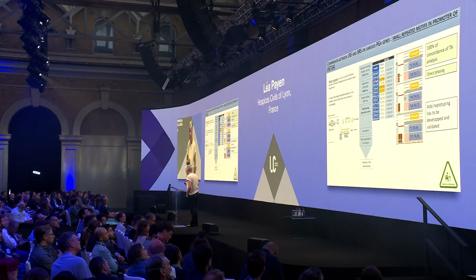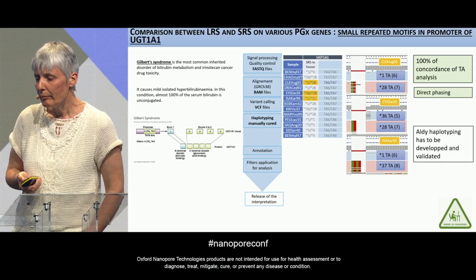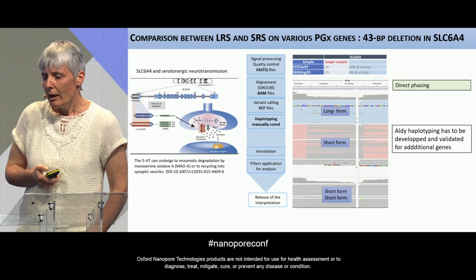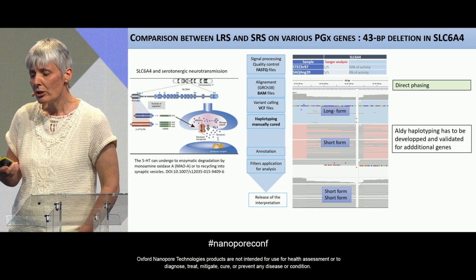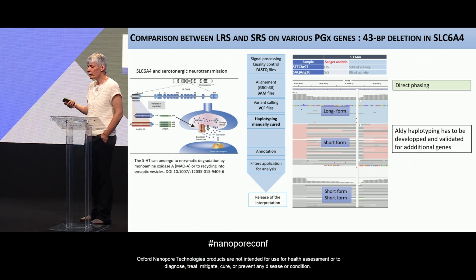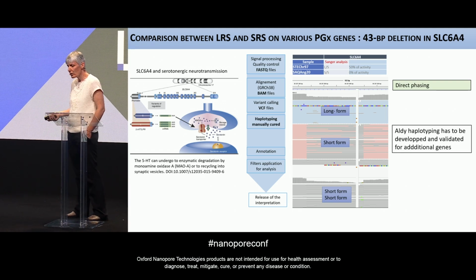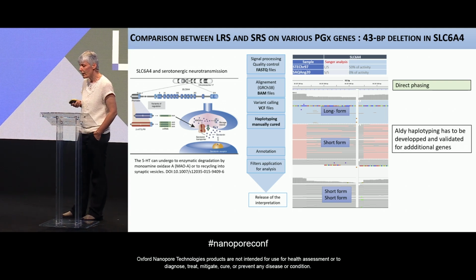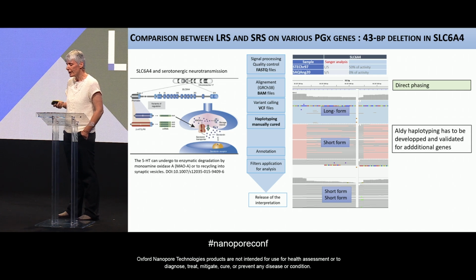So, as you can see in these three cases, it's really easy to determine this modification. Another modification we have to look at is larger deletion. Currently, I'm not able to identify this deletion using short read technique because it's too large, and we do not have the technique to do it correctly.